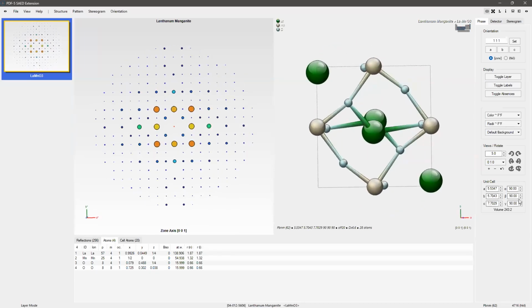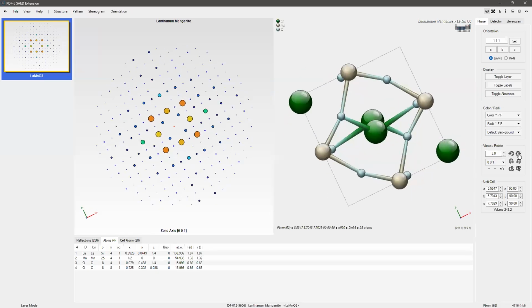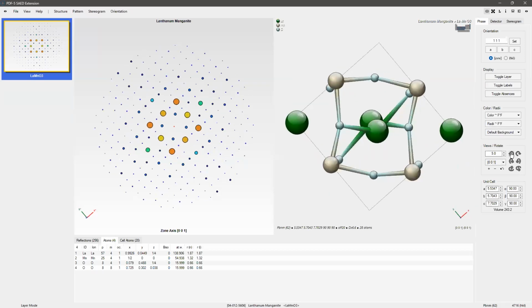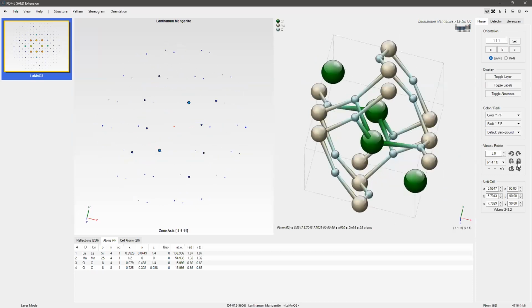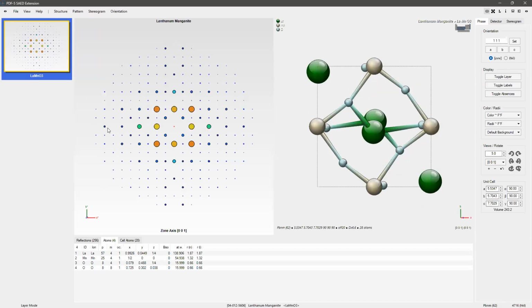Of course, one can use buttons to specify a certain angle and then use buttons to rotate by that angle. On these buttons, by the way, you can left and right click to reverse the direction. You can also just use the mouse wheel directly on those buttons. The advantage of those buttons is that they indicate immediately the direction in which the rotation will occur. But in general, in a mouse-driven user interface, it's more elegant to do this directly in the plot.